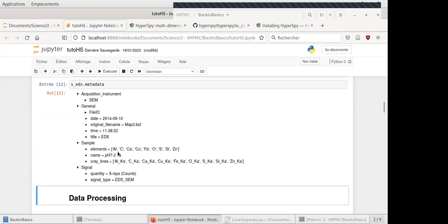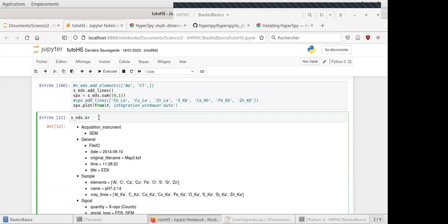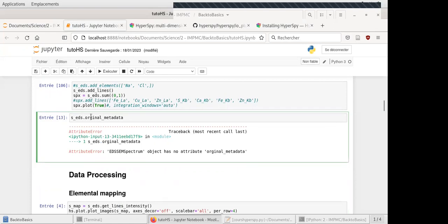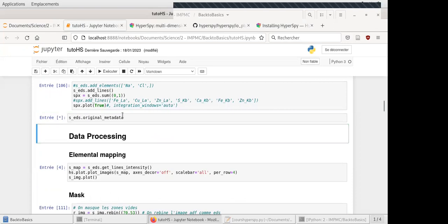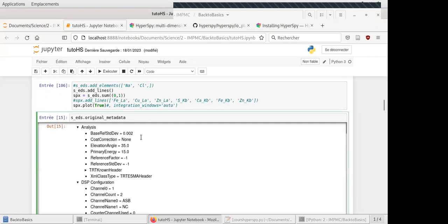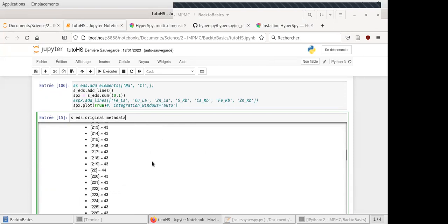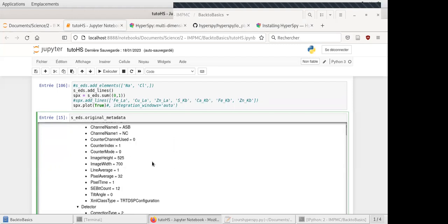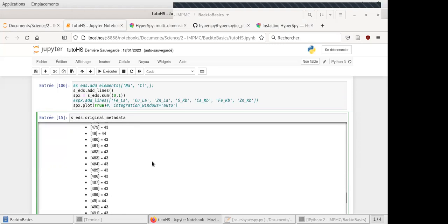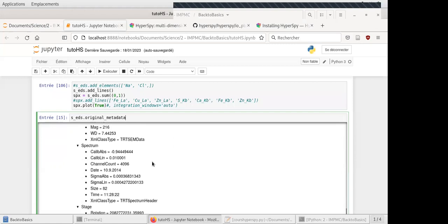In the metadata you have elements like aluminum, carbon, calcium, copper, etc., and the acquisition size and dwell times. This is just a selection, but you can also access the full metadata. You'll see all the data saved in the BCF profile. The selected elements are the ones you chose in the Bruker software during acquisition, so when you reopen your project you don't have to re-enter them.